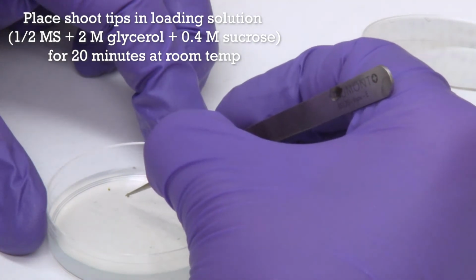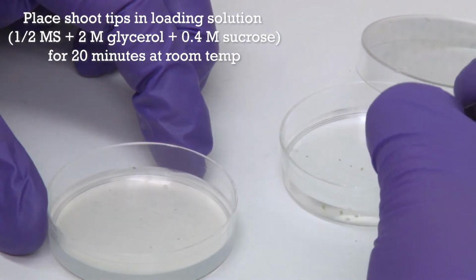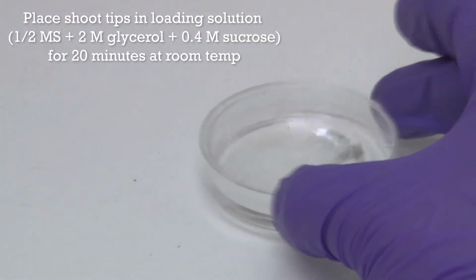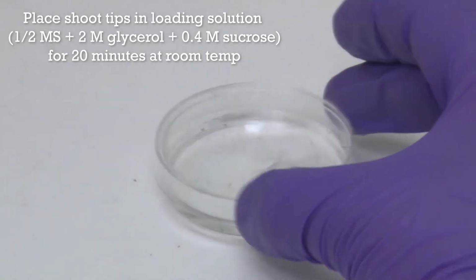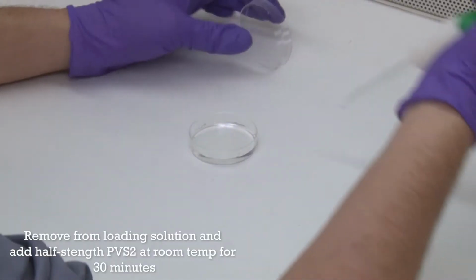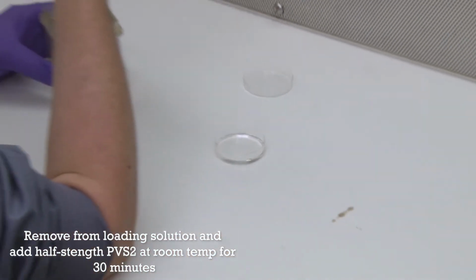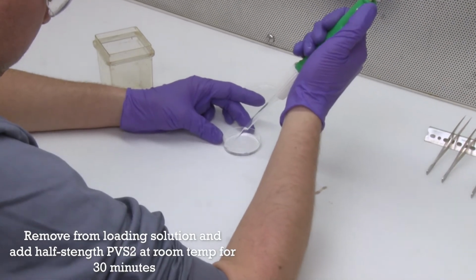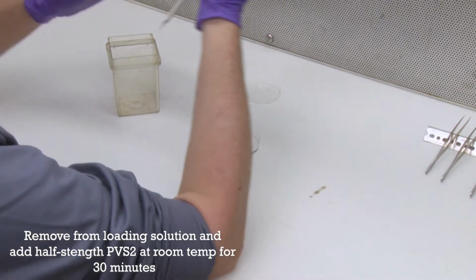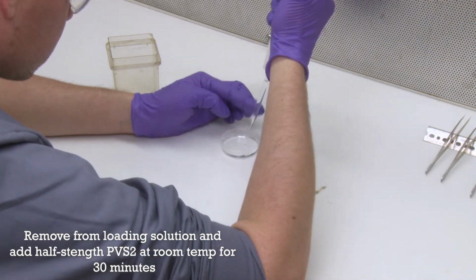The shoot tips can be easily damaged at this point, so great care should be taken when they are removed from the pre-culture medium and placed into the loading solution. Once they're in the loading solution, give them a little bit of stirring occasionally. And after 20 minutes at room temperature, the loading solution is removed, being careful not to get any of the shoot tips into the pipette.